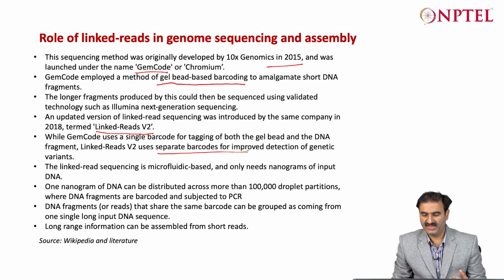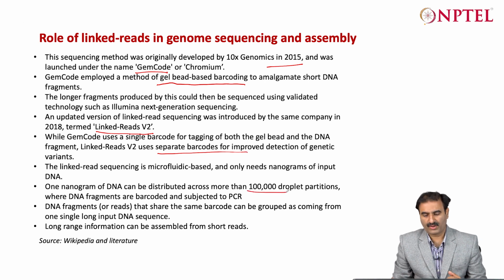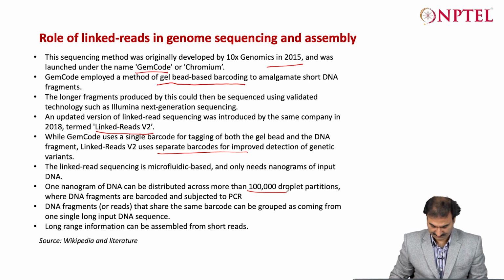So basically it needs very little DNA, right? And that 1 nanogram is spread across about 1 lakh droplets, in which the PCR happens to amplify the DNA fragments for barcoding, followed by the sequencing.